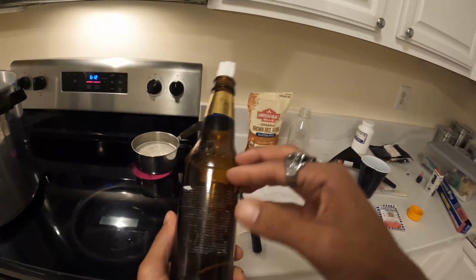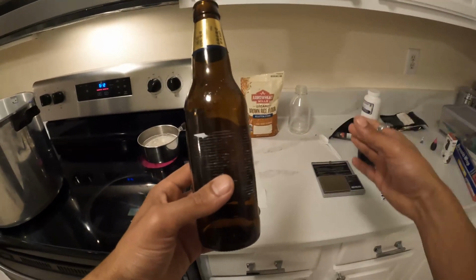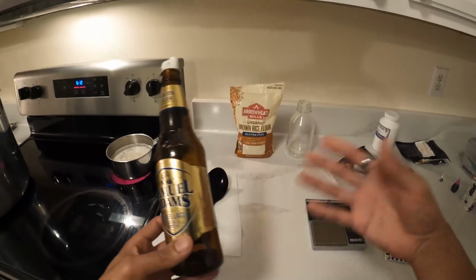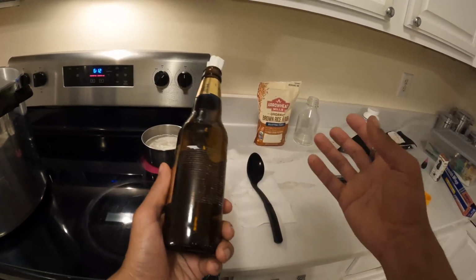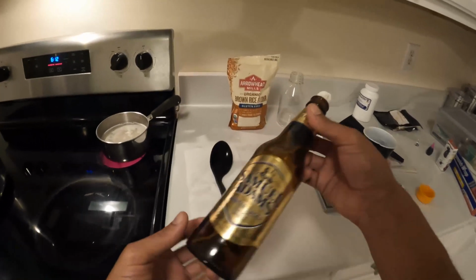I have used bottles like this before when I was in Jamaica. Was sent there to grow mushrooms for a company, and I didn't have the resources that I have here, so I had to use what I was able to gather, and I made my agar plates in red stripe bottles, so they definitely work.